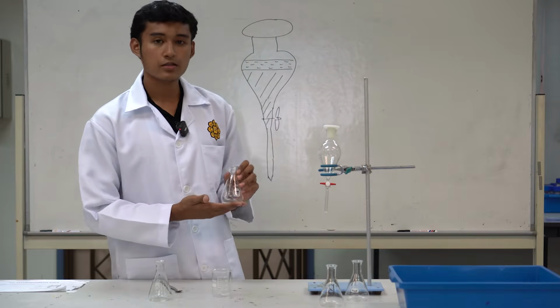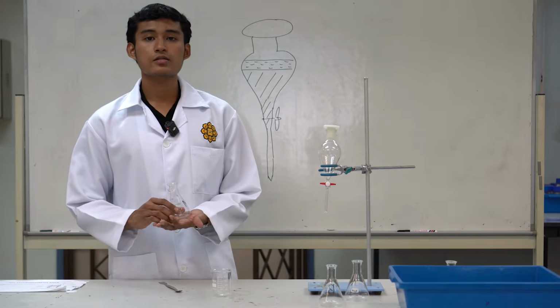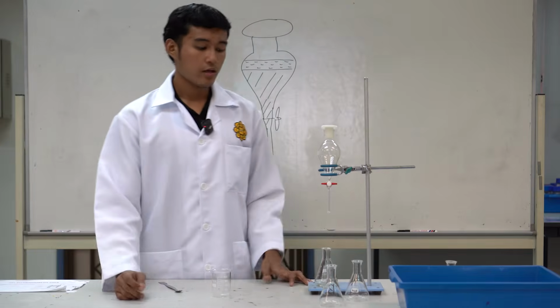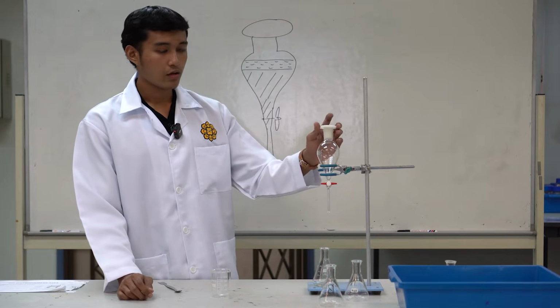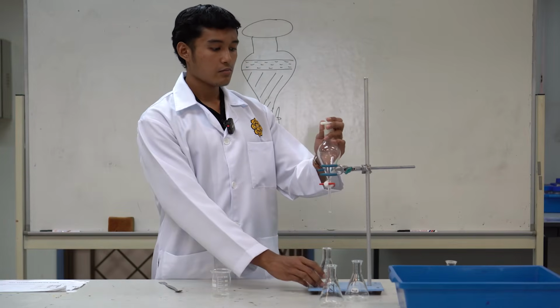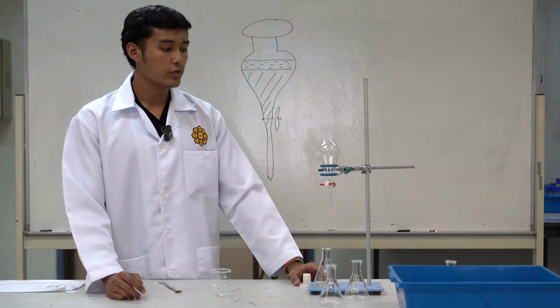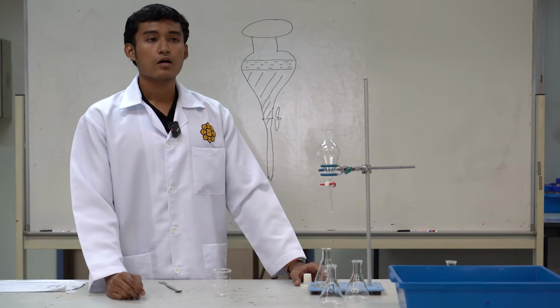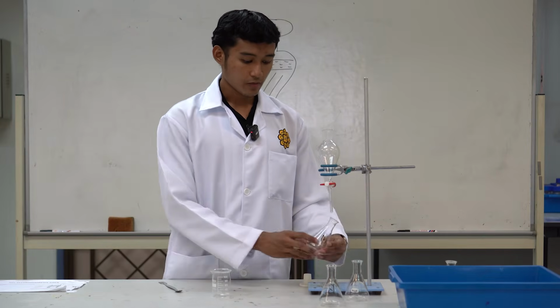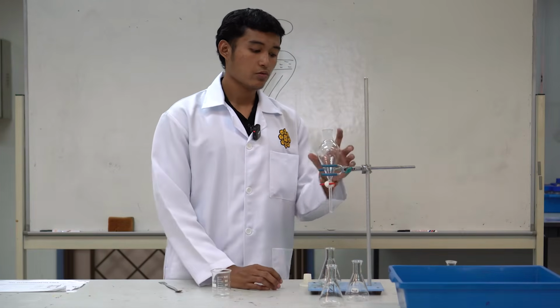So now the acid is done, we put it aside. The mixture now contains the base and the neutral. So now we will continue with the base, and we will repeat almost the same steps, but we will pour in the hydrochloric acid, because now we are doing it for the base. So we will repeat the same step, extracting.